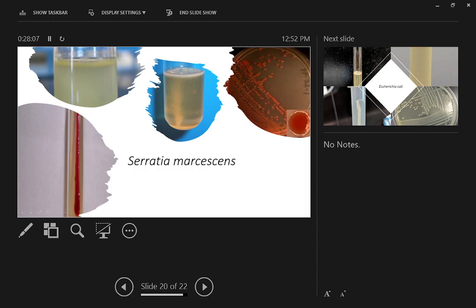So they all grow differently depending on conditions like time, temperature, humidity, type of media you're growing them on. But Serratia is actually pretty easy. If you look at it right here, these little edges, these are little teeth. That means it's serrate, thus the name Serratia. So they're serrated teeth on the edges. It's got a nice glossy pigment that's kind of moist. It's motile, so it'll move through media rather nicely, making it cloudy. Same thing for the broth over here.